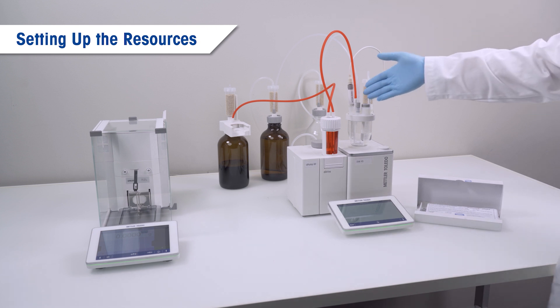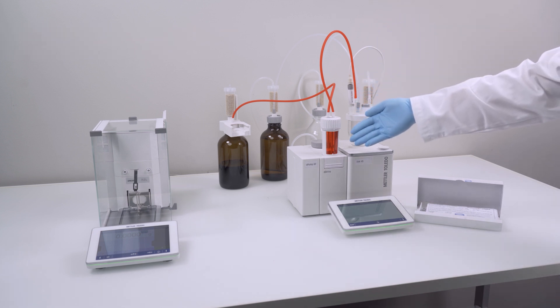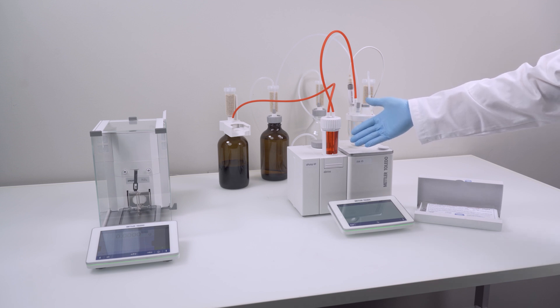Let's start with the setup of the resources that are needed for the concentration determination. The polarized sensor and the burette with the assigned titrant are automatically identified and created by the system upon connection. However, the KF cell and the concentration standard are not automatically set up and need to be manually configured to be used in the titration method later on.